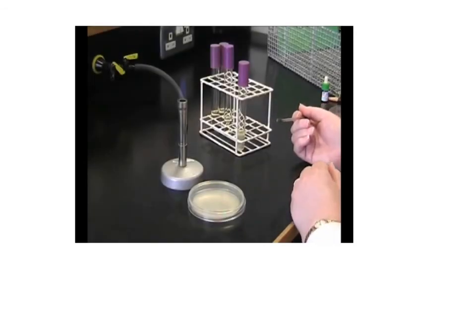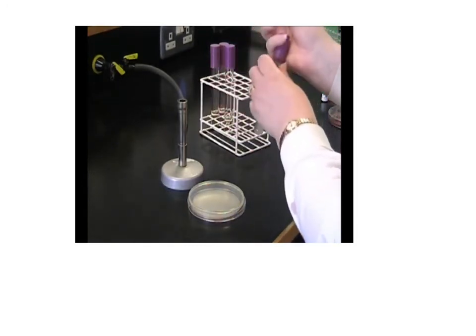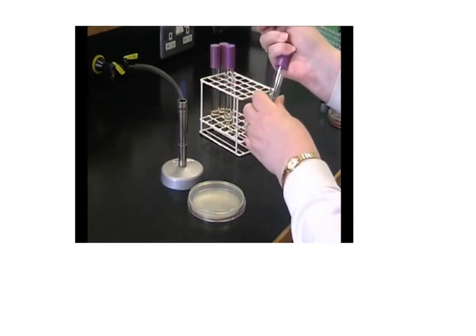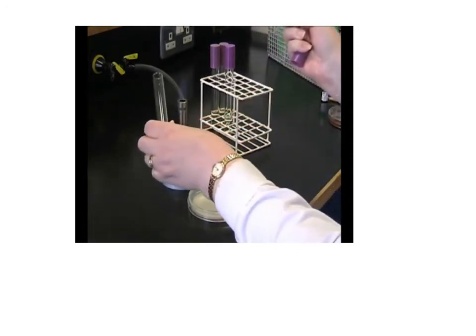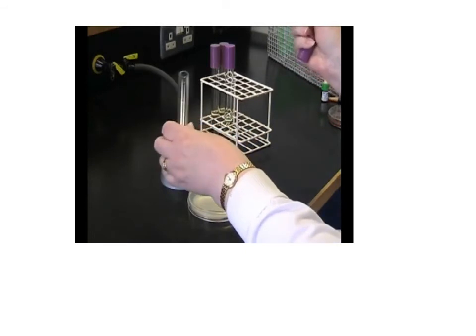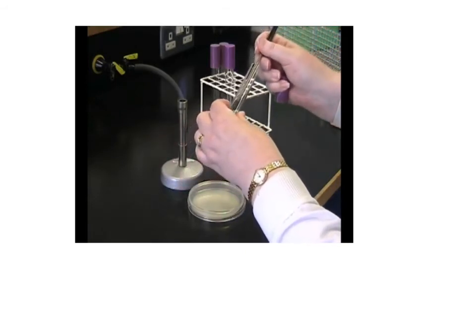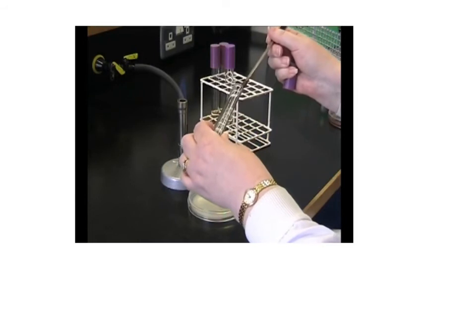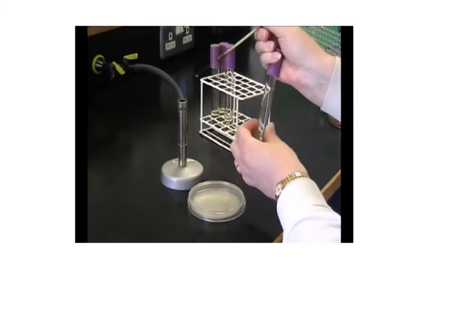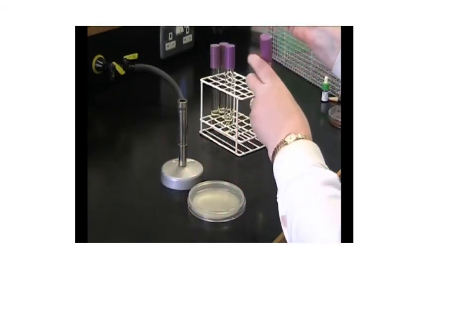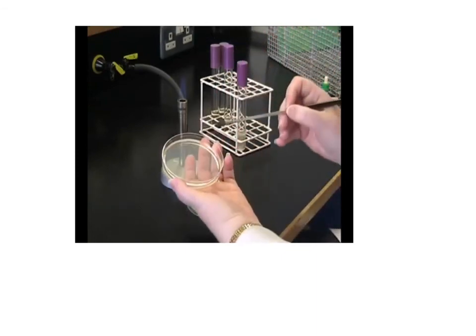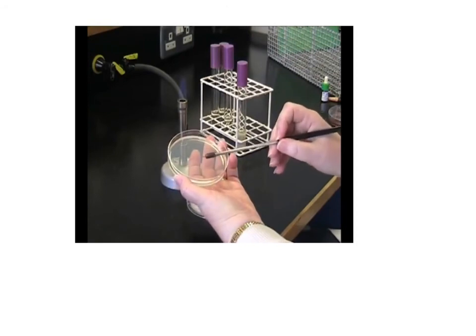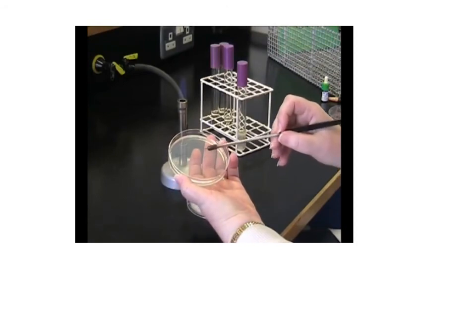To inoculate from a broth culture, use the same technique but holding the test tube, remove the cap with a little finger. Make sure you flame the neck of the test tube through the Bunsen burner. Using your cooled and flamed loop, remove a loop full of bacteria. Place the lid. You then streak this out onto the plate as before, making your primary streak, and then flaming your loop.